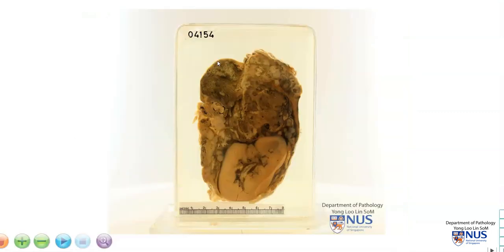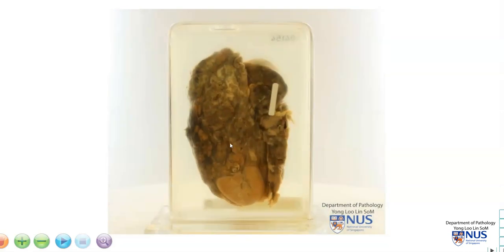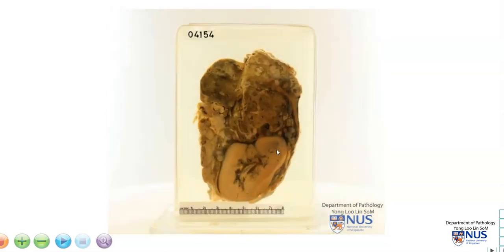In summary, this is an example of a suprarenal tumor involving the region of the adrenal gland, which is no longer seen in the specimen. We have a large variegated tumor with darker areas of hemorrhage and pale areas of necrosis. This tumor does not appear to directly invade into the kidney in this particular plane of sectioning. This is a neuroblastoma.